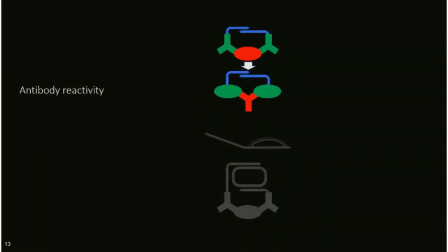I'll just say a few words about version. We have inverted the PEA assay. So at the top you see the regular PEA assay. Now we have also conjugated oligos to antigen, and now we're looking for antibodies that are able to bring 2 copies of the antigen in proximity. And if so, then we can detect that by the same means as in the regular PEA assay.